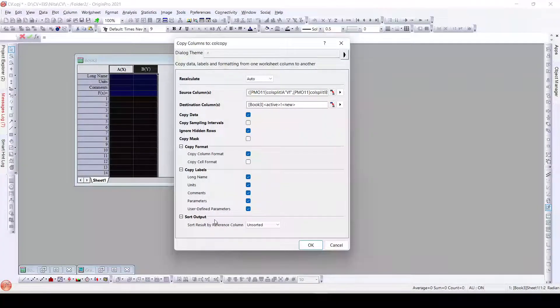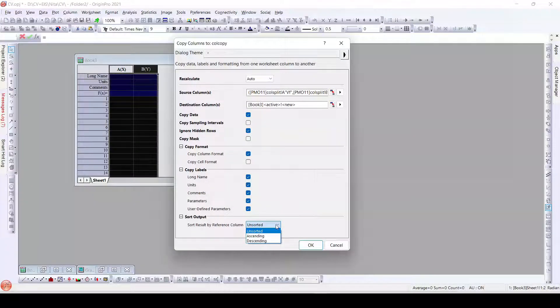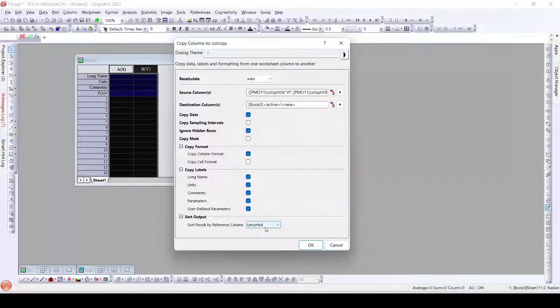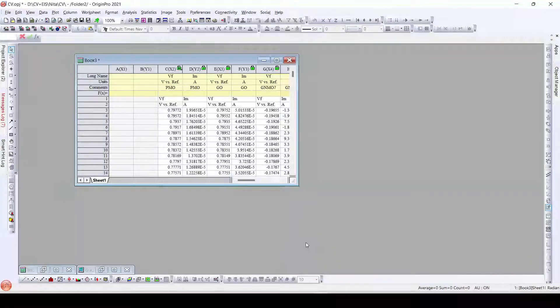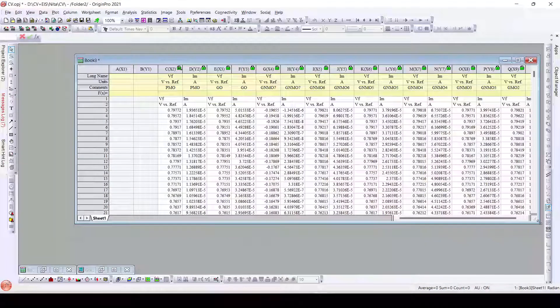Finally, what we have is Sorted Output. If we need a sorted output, either ascending or descending, we can sort them. But here we don't need any sorted output, so I will select Unsorted. And now just by clicking OK.